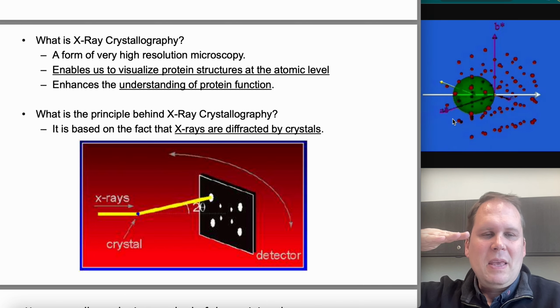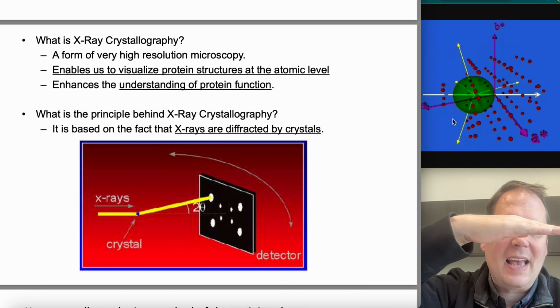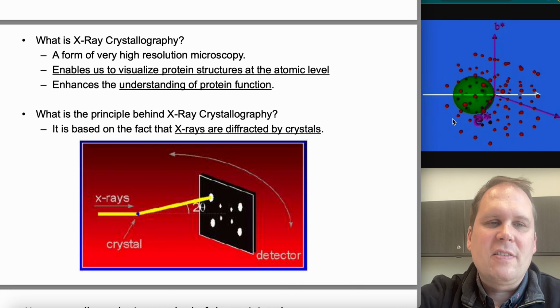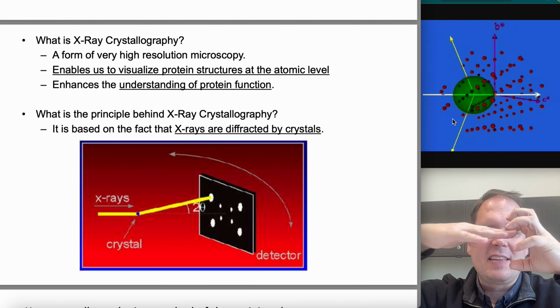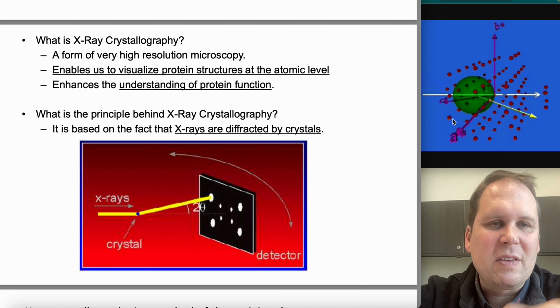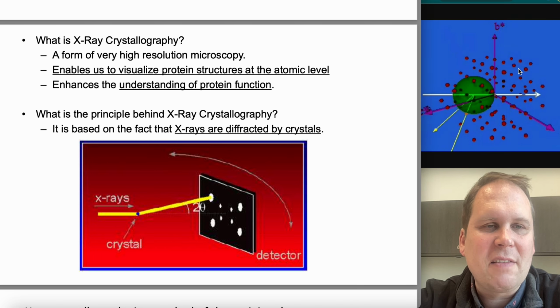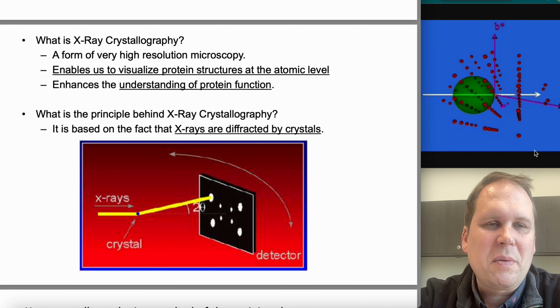In that X-ray beam, all of the X-rays that come out are just about exactly parallel. When a bunch of parallel X-rays hit a bunch of things in a static organization, you'll get particular deflections. Every once in a while, some of these X-rays are going to get flicked, deflected a little bit from where they were headed.